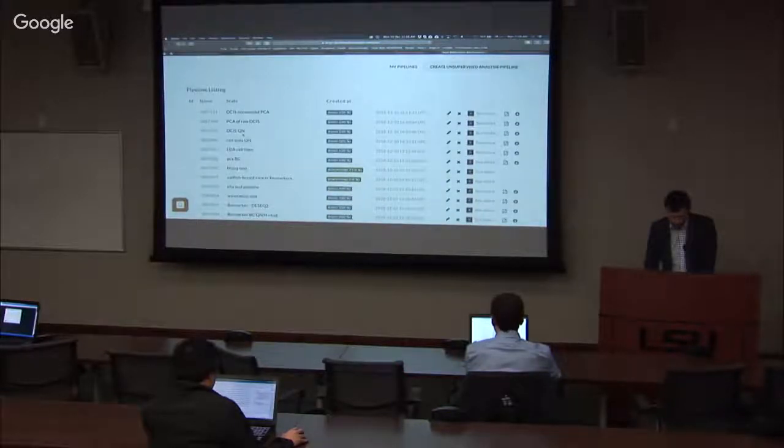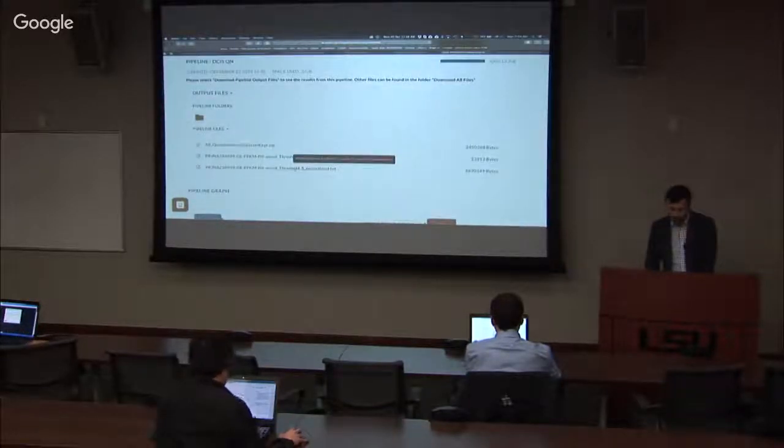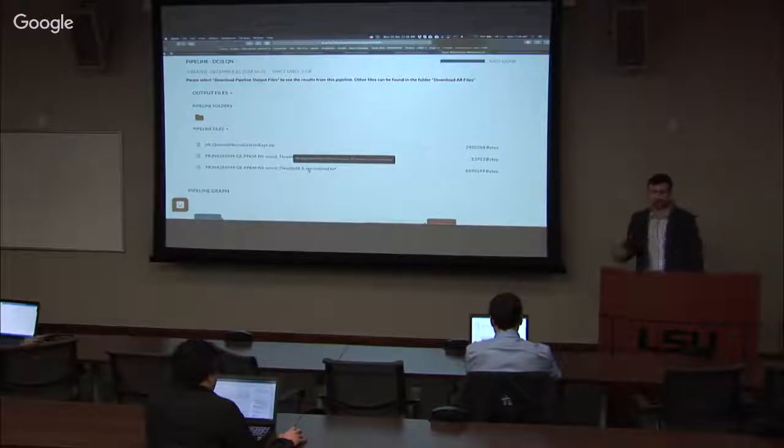this was for DCIS QN. Here you have the normalized file right here. So if you just download this file, did you run this pipeline? I'm running it right now. So just reload the page and it will be, I mean, it shouldn't take long.